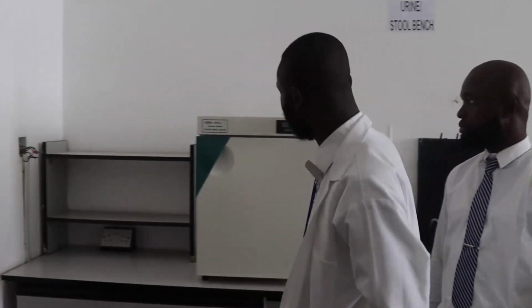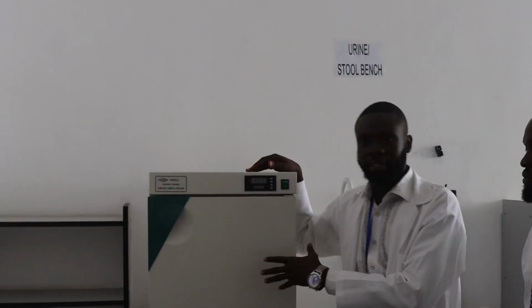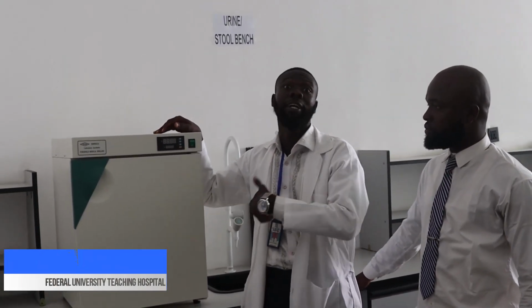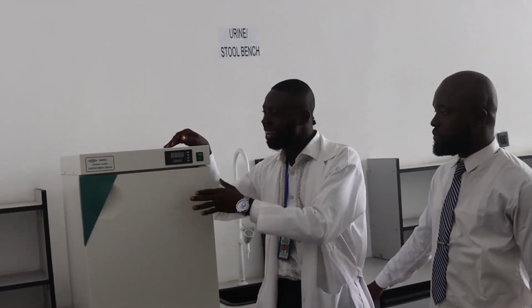Alright, let's start with this particular one. As you can see, this is our incubator. We use it in microbiology majorly to incubate organisms overnight, so that they will have exactly the same conditions you have in your body.